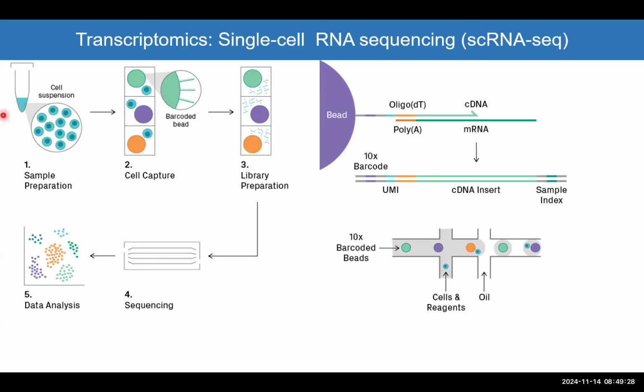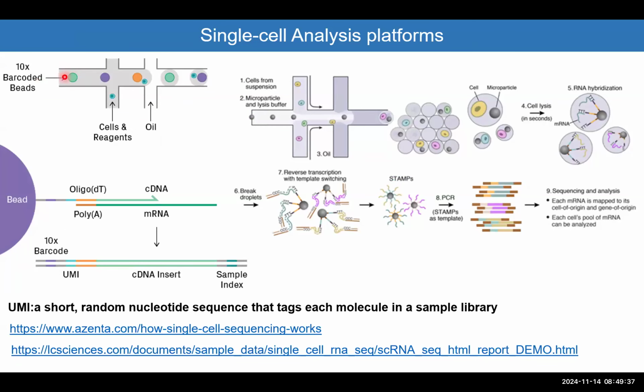So first, we took the samples and we dissociated them into single cells. After that, I took those and inserted them into the 10x machine. The 10x barcoding machine works like this: you have one side where you get the beads, and from the other side, you are getting the cells. So when you insert the cells.